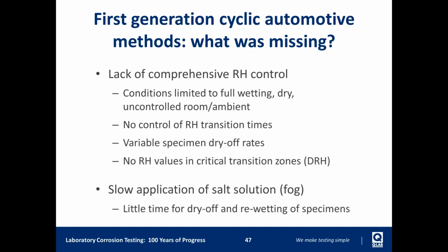The other thing that they ran into is that, with the exception of 9540P, they all applied salt with fog, and fog took a really long time to apply. And so they needed some faster way to apply the salt so that they had more time to spend in these humid environments.